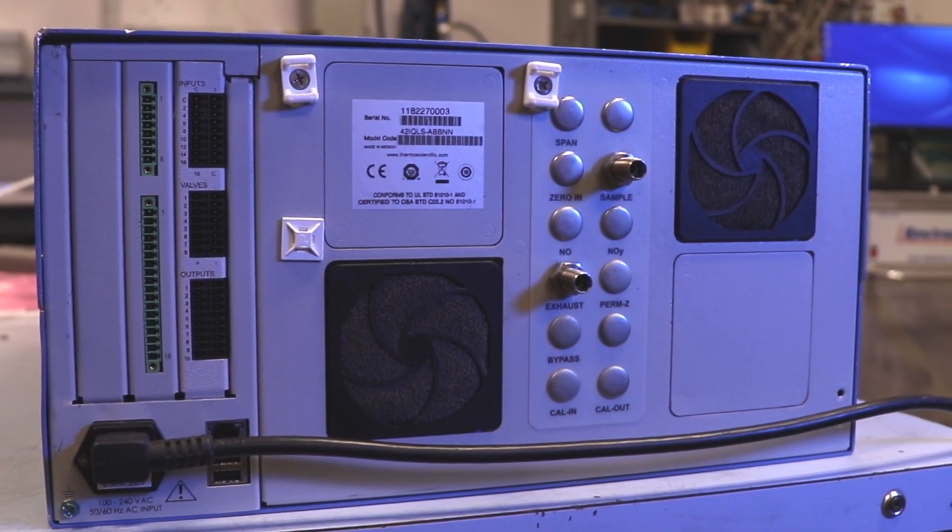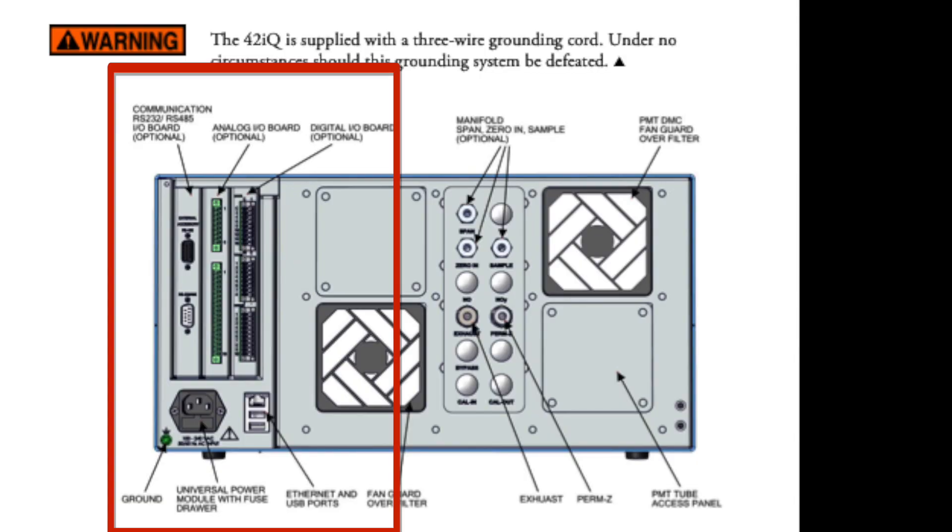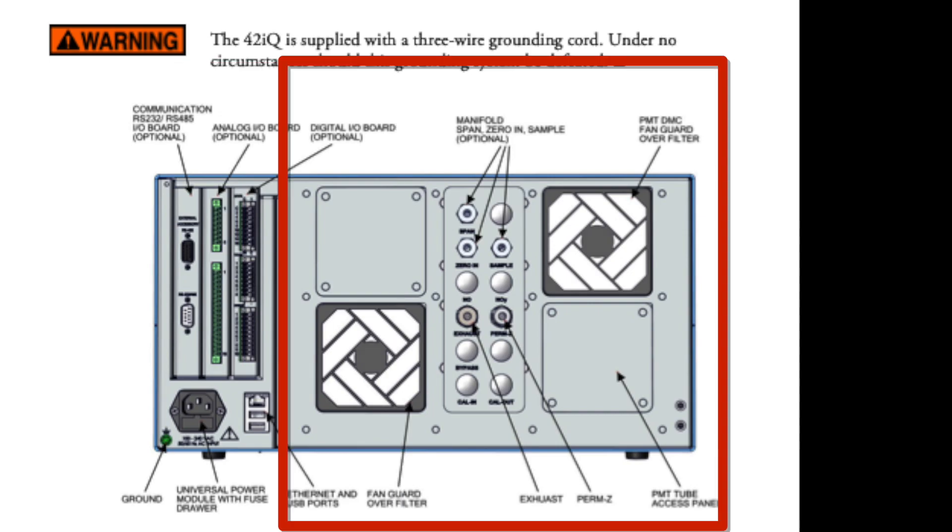Moving to the back panel, we see options for RS-232 and 485, analog, digital, ethernet, and USB ports for communications. We also see power, two fans, and a PMT access panel.